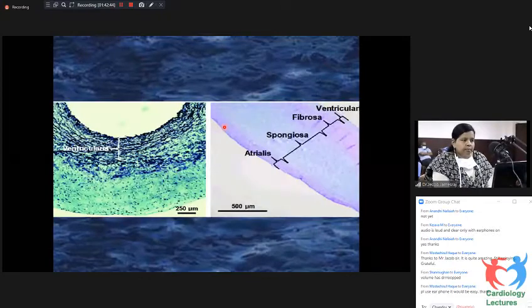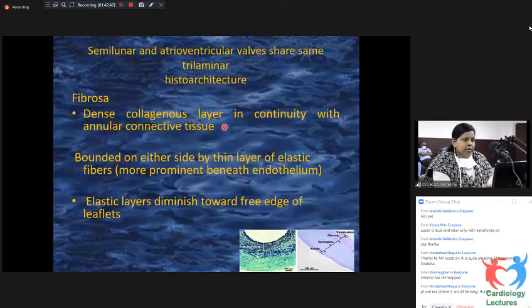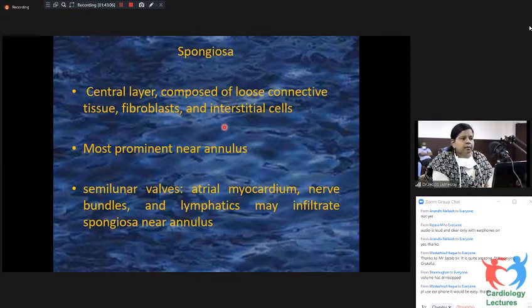So the ventricles of the heart are composed of spiraling layers of fibers that run in different directions. Consequently, in microscope sections, they contain profiles of cells of different orientations. Linear arrangement of cells are only found in the papillary muscles.